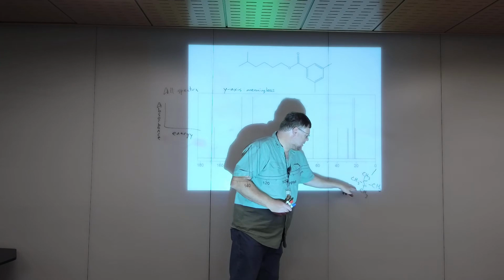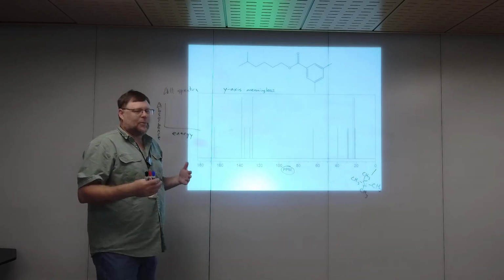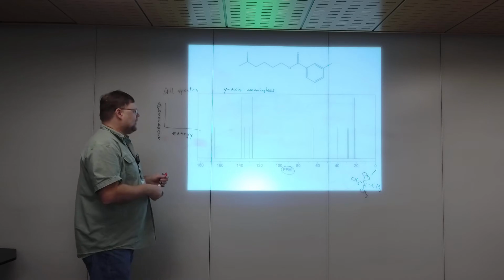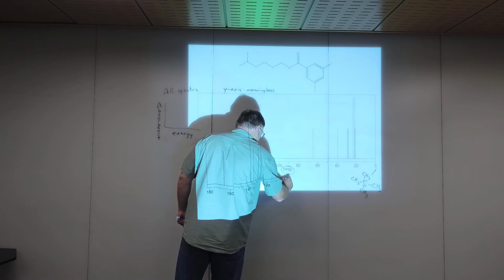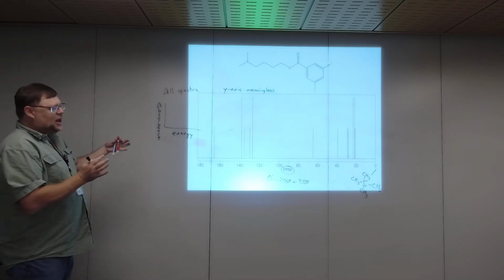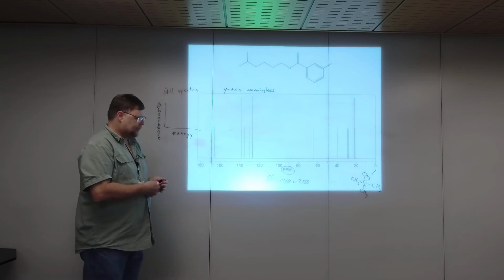And the other thing to look at is in this molecule, this goes back to molecular symmetry, all 4 of these carbons are magnetically equivalent. They're chemically equivalent. We can't tell them apart. There's one signal there. You're always going to see 0 to like 180, 200, something like that. Typically, this is going to be 0 to 200 or 250. It might be less, like we may zoom in. If there's nothing left of 60, I'm going to zoom in to 0 and 60. And then you're just going to see a peak. This corresponds to a carbon.